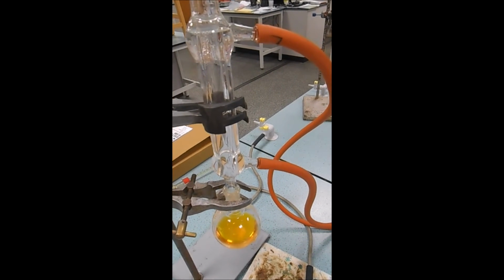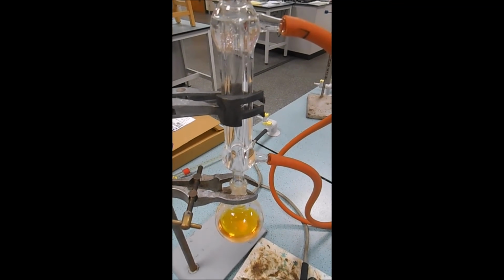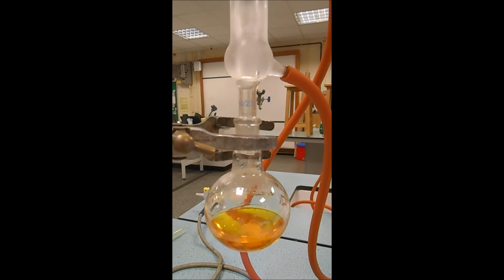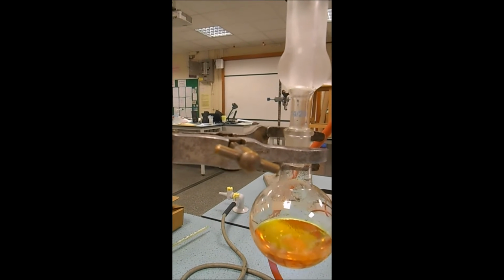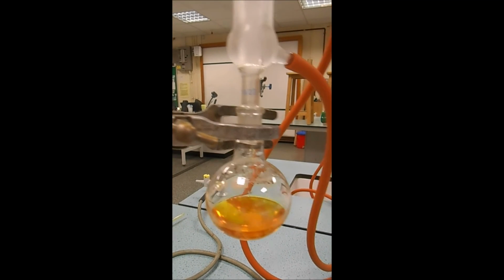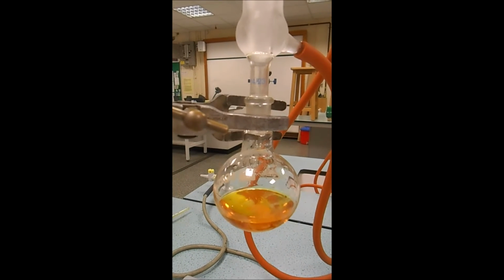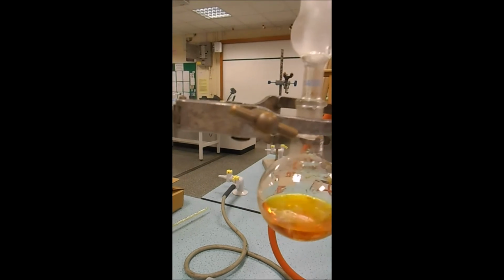We'll leave this here for a reasonable time to make sure that as much has reacted as possible. Relatively gentle heating. We don't want to go too hard. We're not monitoring a temperature this time. But remember, we only need to heat this up to about 100. So that'll be the, you can see the boiling of the propan-1-ol. And then everything else will start to boil in a minute. There we go.